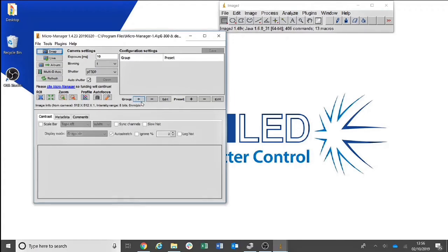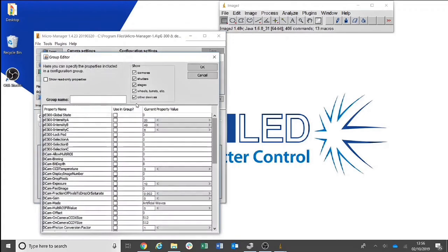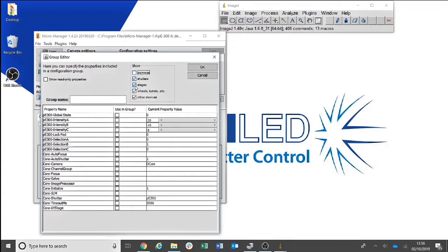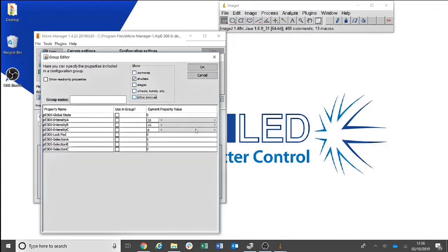First of all, click the plus next to Group. As we are just adding the light source settings, you can hide cameras, stages, wheels and other devices.